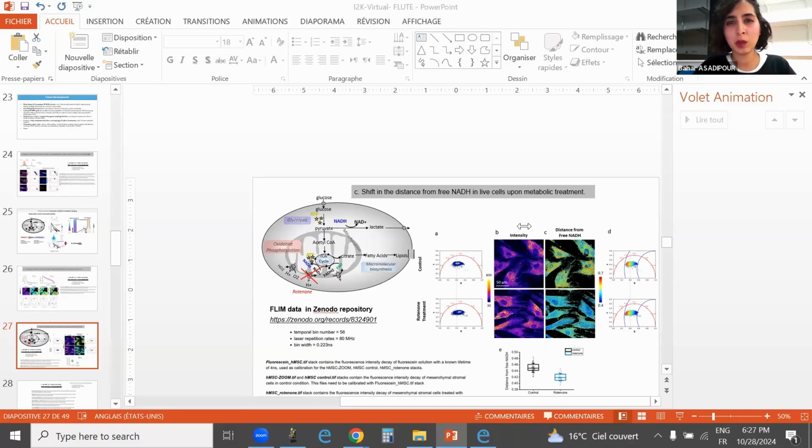For the moment, no. But this is an interesting feature that can be added to the program. For the moment, you can only do one TIFF stack at a time, but you can do batch processing. Meaning if you have your time lapse in separate files, like time points, instead of in one stack, you can do batch processing, and that is rather fast.